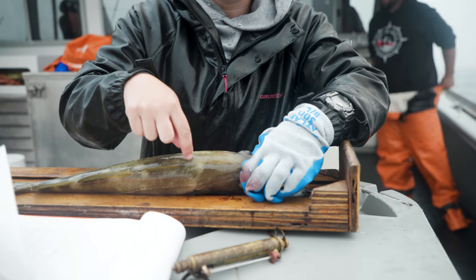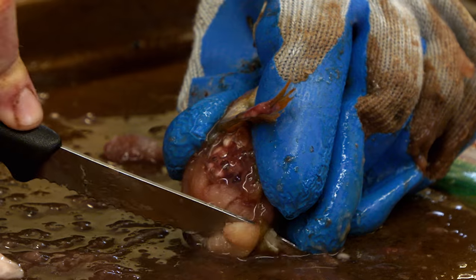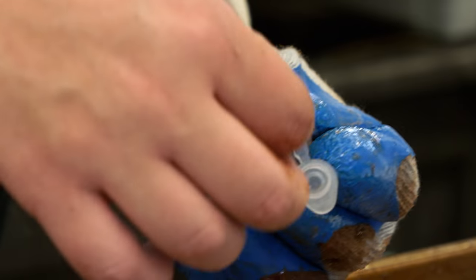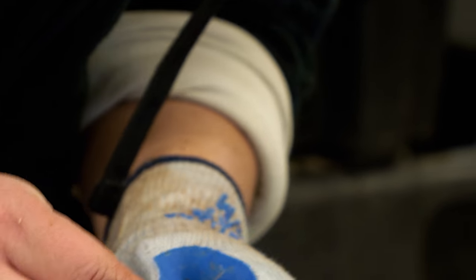We'll also take a muscle tissue sample from right here. It's kind of similar to looking at the stomachs in that it can tell you what they've been eating, but it tells you what they've been eating over a longer period of time.